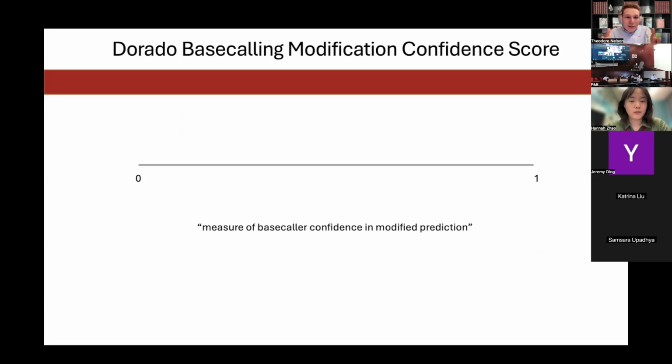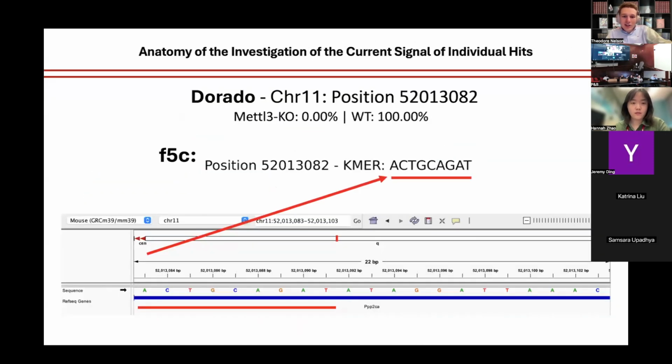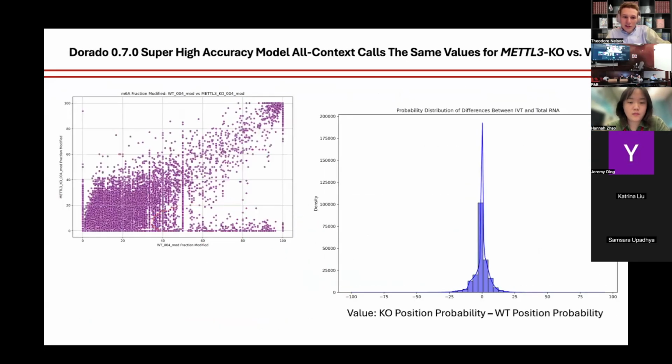So okay, we have this modification confidence score that we learned about. Why did you get all of this? It's because of the modification confidence score that was used for this particular compilation in ModKit, which is the software that takes the BAM files and aggregates per site the confidence in terms of the m6A site stoichiometry for that site.